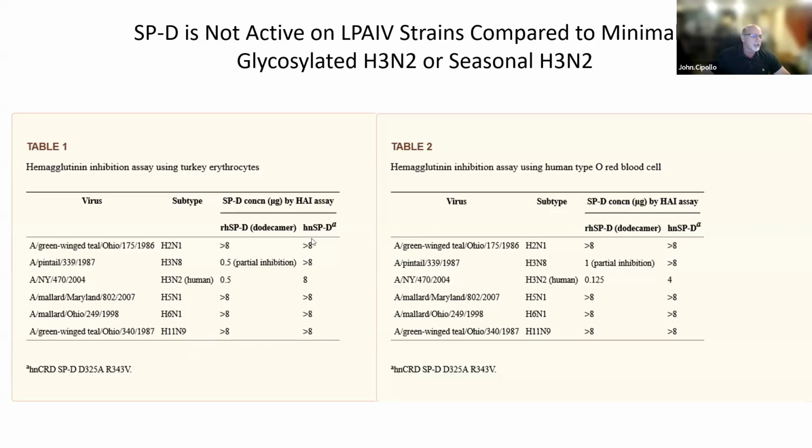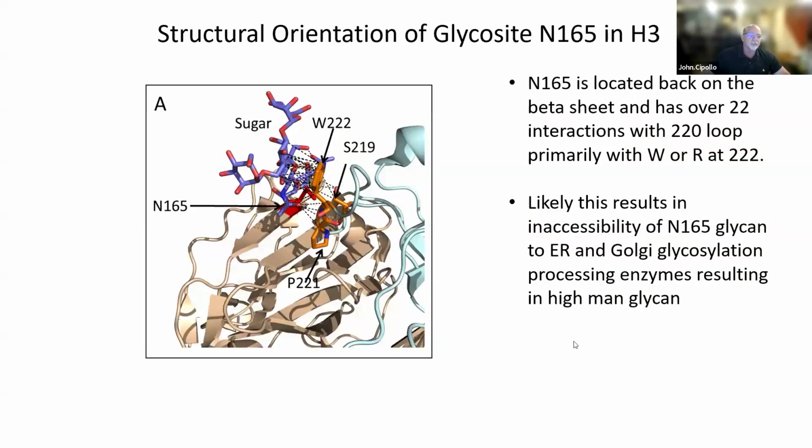So you can see in this context, there was interaction with a lower amount of SPD compared to the avian strains. And similarly over here, even better interaction, and we really saw that increased mannose have an impact. So it looked here as though these influenza strains, their HA, was really not interactive with SPD. So we've already gone over this.